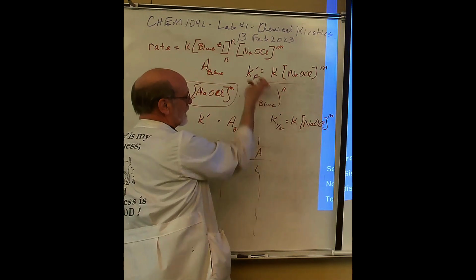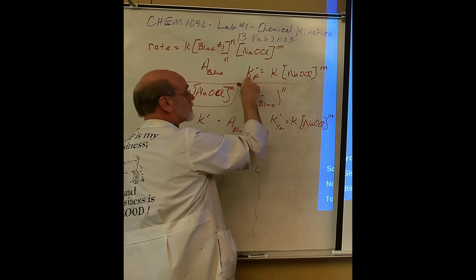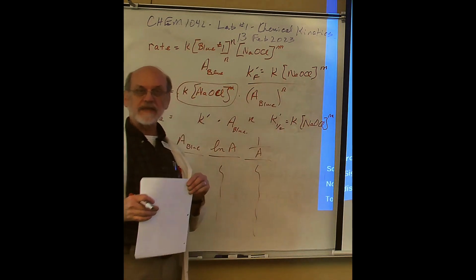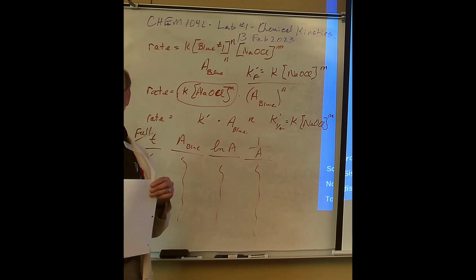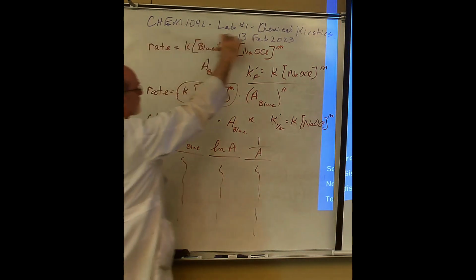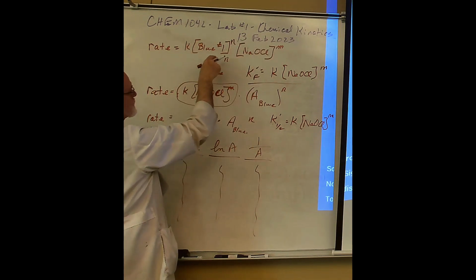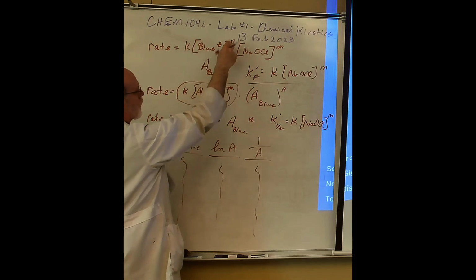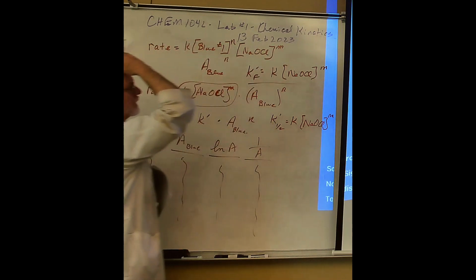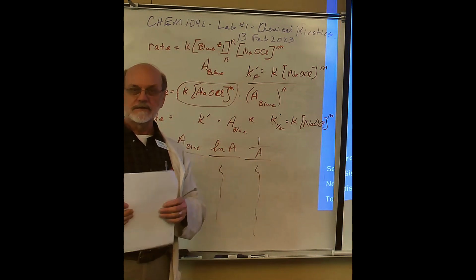It doesn't matter whether it's half or full, either one of these, but the value here and the K associated with it and the power, then you can solve for K. That's how we get at the true rate constant. And then when you write your full equation, you just say rate equals that value that you determined times absorbance to the whatever power times the sodium hypochlorite to whatever power. And that would be your rate law for this reaction.